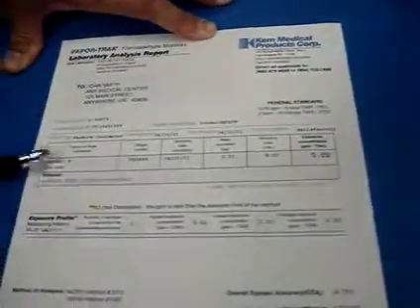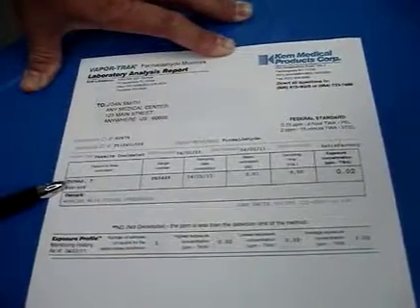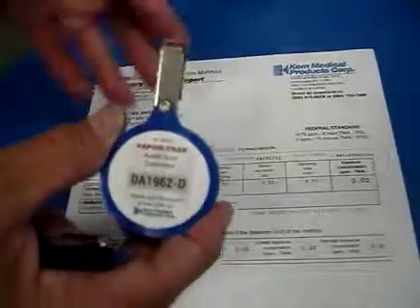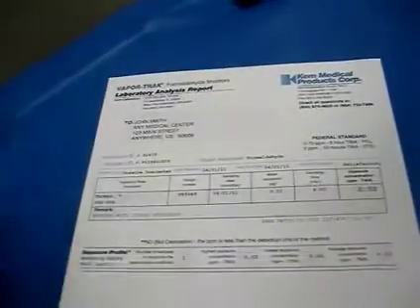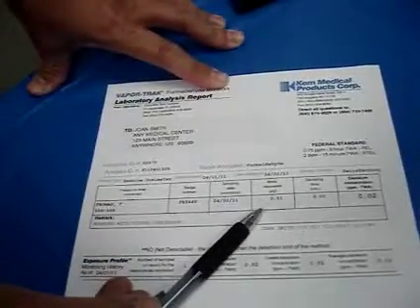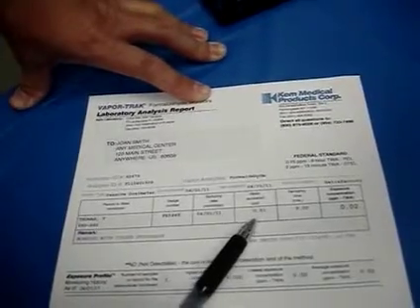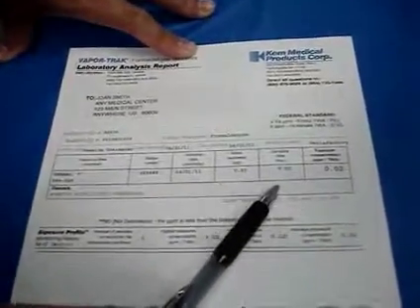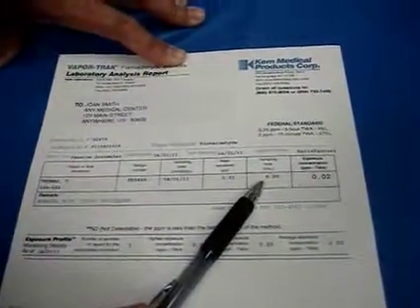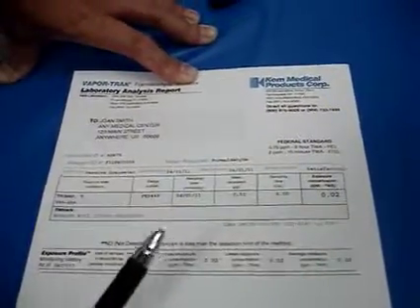This area here is going to list the monitoring badge that was used that day. Here's the person, T. Thomas. The badge serial number. On the back of the monitoring badge, every badge has a serial number. So the serial number of the badge that was used, the date that the badge was used, and the mass recovered, that's more for the laboratory. That's the actual amount that was recovered onto the badge, but you don't have to worry about that. The sampling time, the duration that the badge was used, this particular badge was used for 8 hours, and then the concentration, 0.02 ppm for this particular badge.